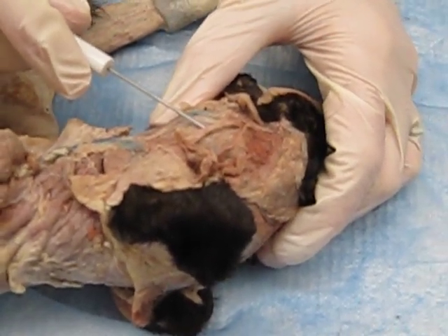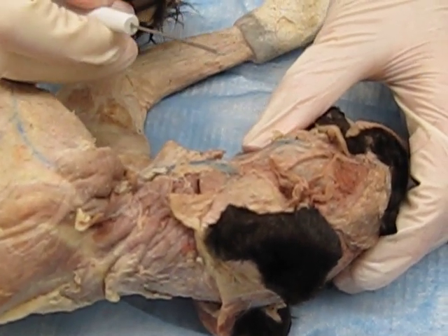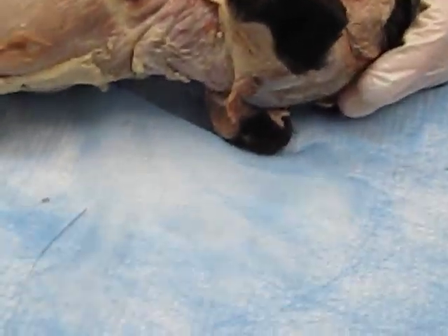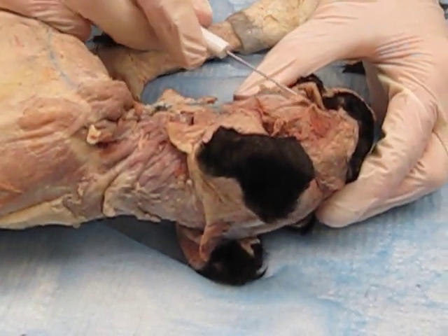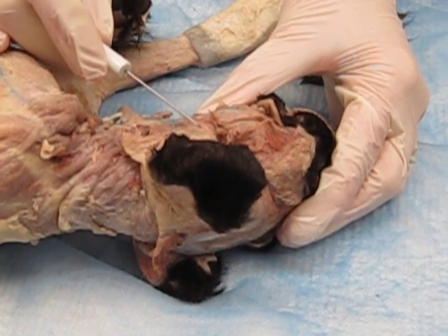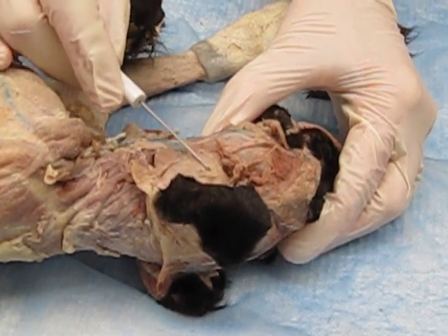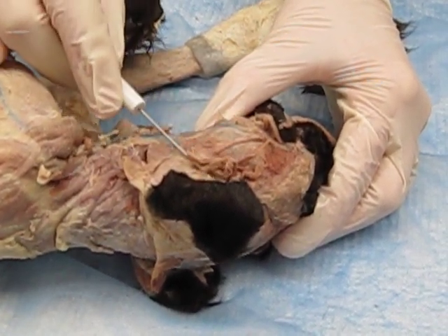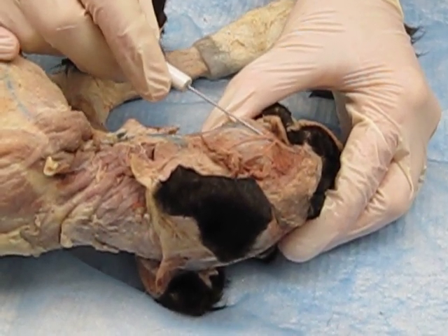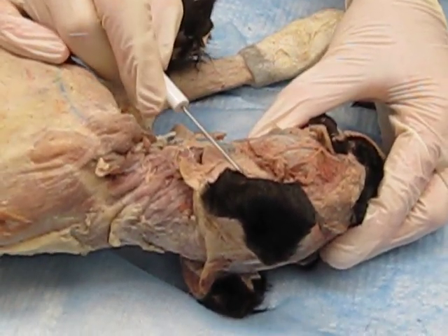I'm sure Dr. Alderson has mentioned one of the keys to studying for this information is that most of these structures are labeled or named based on where they're located or what they're doing or where they're going. Okay, so parotid duct goes from the parotid salivary gland, which you can see on your page is that green structure under the ear. Okay, you have fascia over there initially, so you're going to have to dig away from that and you will see this parotid salivary gland. And you see the duct that's attached to it? It goes all the way to the mouth.